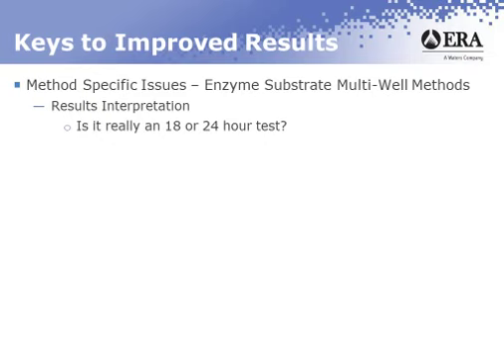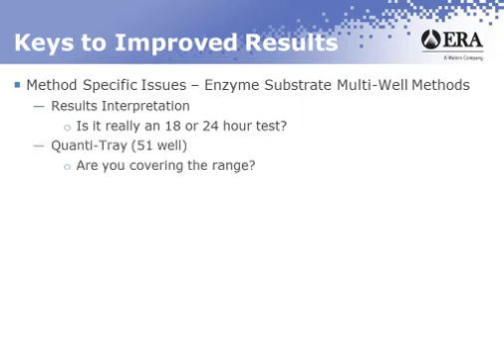If it is not, then it means that the result could potentially still be definitive out through whatever that read time is. So even though you get these products and your standard practice may be, well, we always read them at 18, you may be cutting yourself short, because technically the manufacturer still considers the result to be a positive result if it changes within a certain time window. It's not until you get outside of that window that a negative result is considered definitively negative. So make sure that you're aware of that.